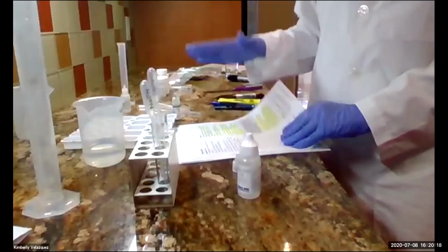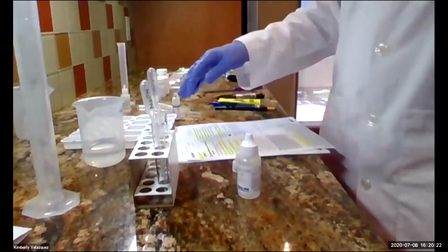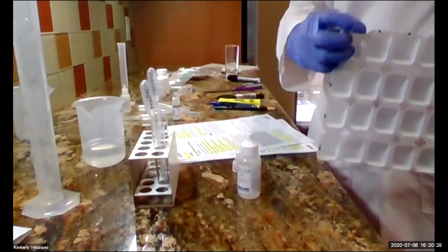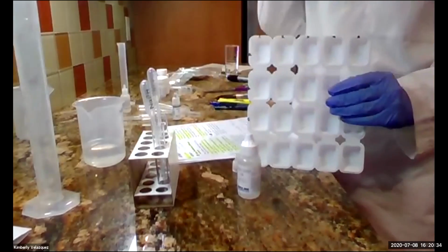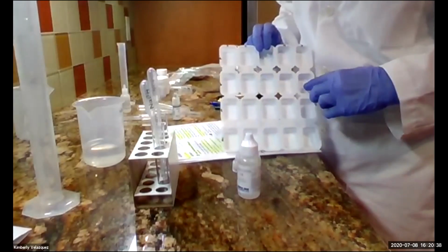Okay, after you've done all of that, now you're ready. So basically row A is going to be your control row. Across the top here, you're going to end up with just water in row A. And in row B, you're going to end up with your pH 4 buffer all the way across.